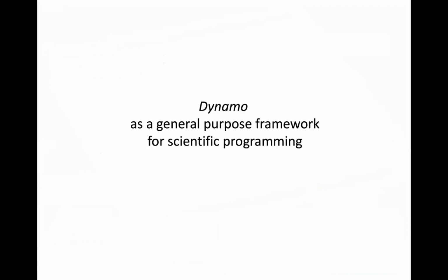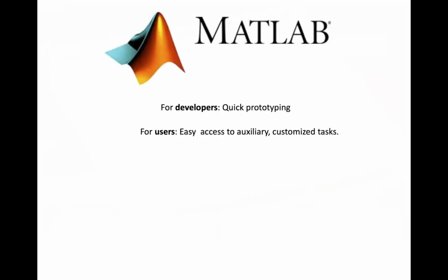And my last couple of slides. Many users are surprised when they find out that Dynamo is written in a big percentage in MATLAB. The reason for this design decision at the beginning is that tomography is certainly not a streamlined technique like cryoEM is becoming. When you have a new idea, you have to do a lot of prototyping, you have to test a lot of different things. And to my taste, MATLAB is a very good environment for prototyping.